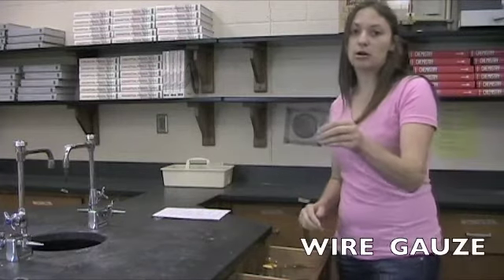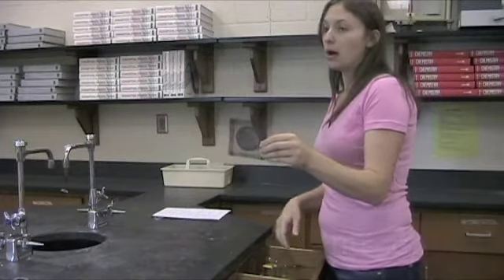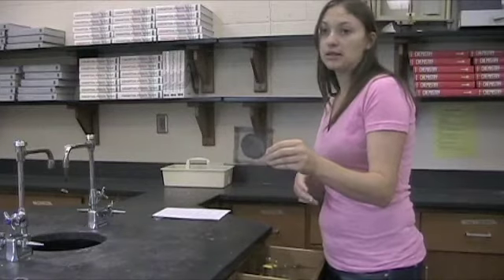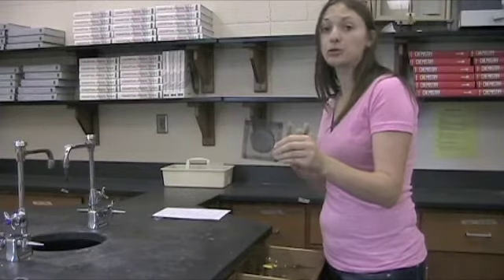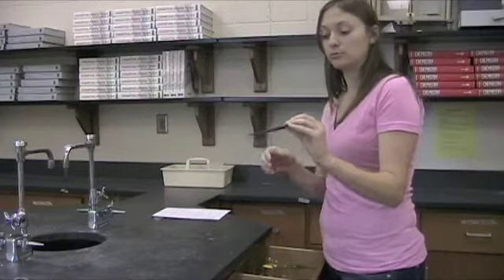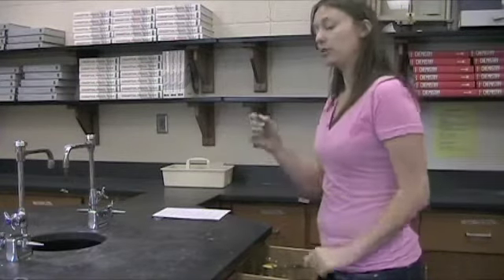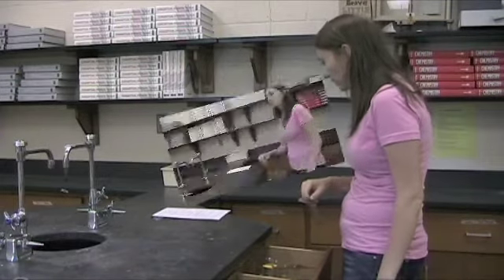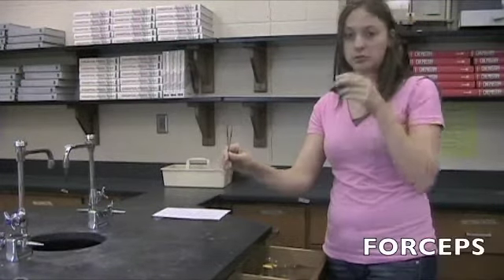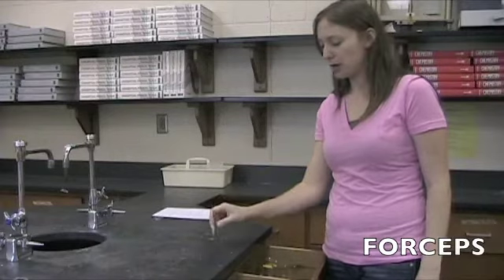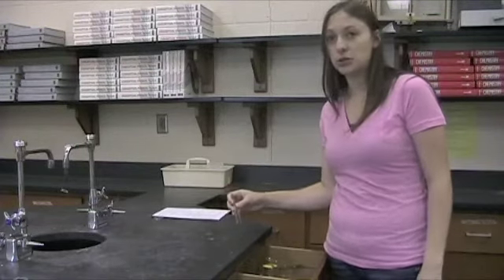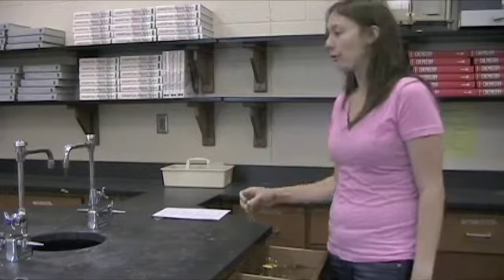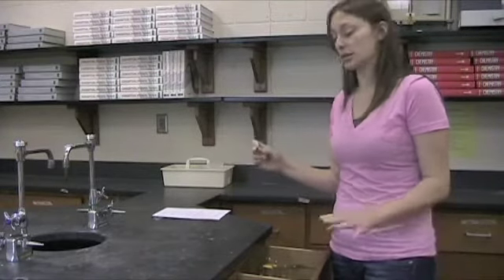I've got wire gauze. Wire gauze is used to hold evaporating dishes or other things like beakers, flasks that I want to hold over a Bunsen burner and get them to heat up for some reason. We'll use this a lot because that can set things on top of the flame. Forceps or tweezers are used to pick up small items that I can't touch or if I want to put something in a test tube or if I want to get something out of a jar. These are very handy for things that I don't want to touch.